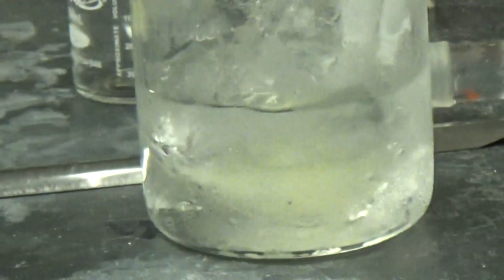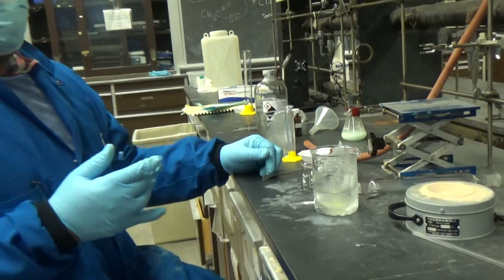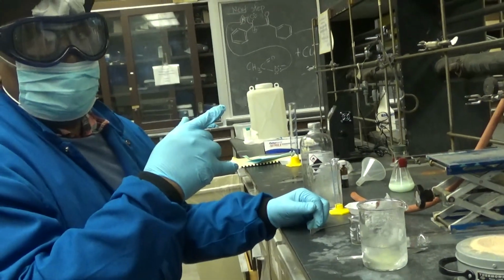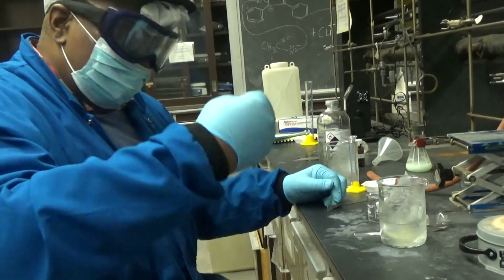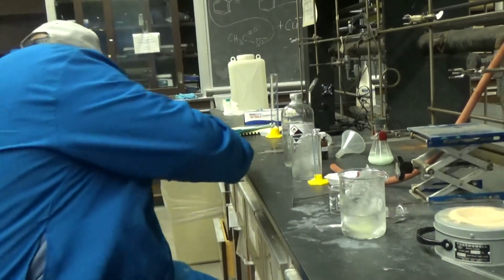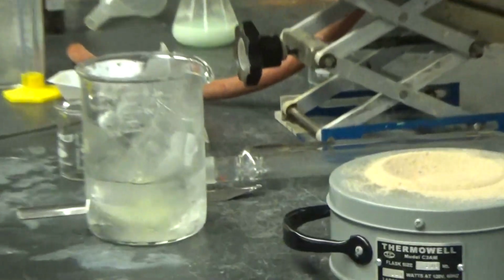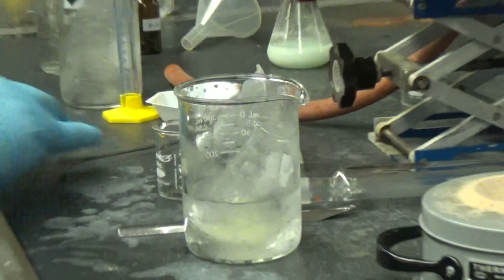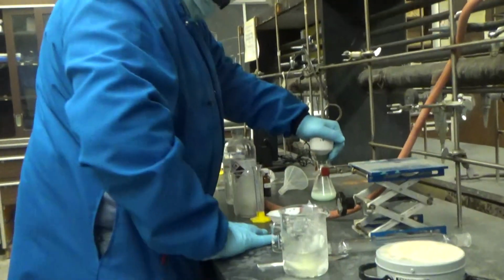I think taking the boiling stones out helps, because they're sort of crystalline themselves, and the crystallization gets confused if there are other solids. Like whenever we have an experiment in organic chemistry where we use charcoal, you need to filter it out. So once you have a little bit of crystals, then you put it in ice, and you'll get a whole bunch of crystals. It's seeded the process.